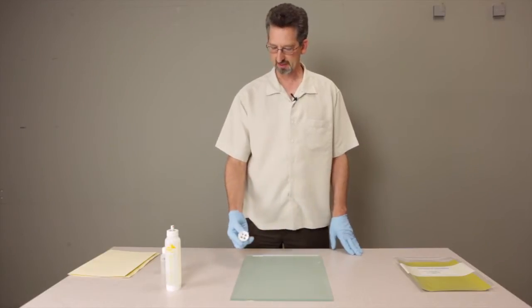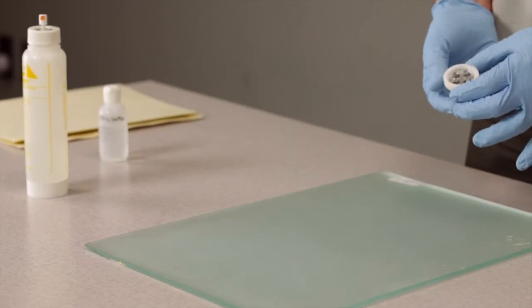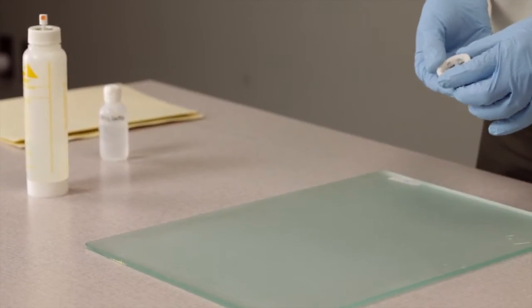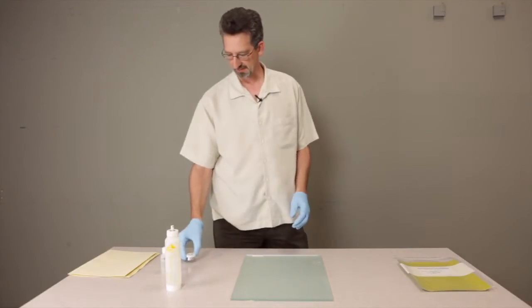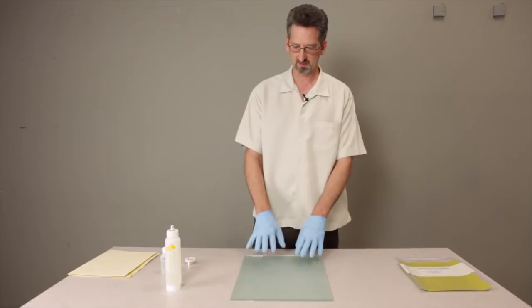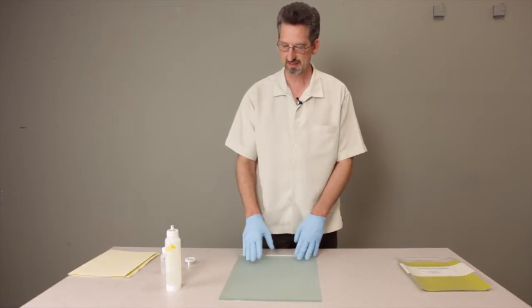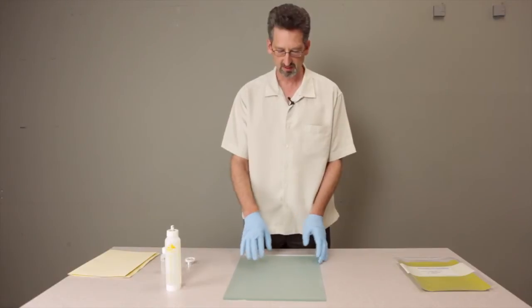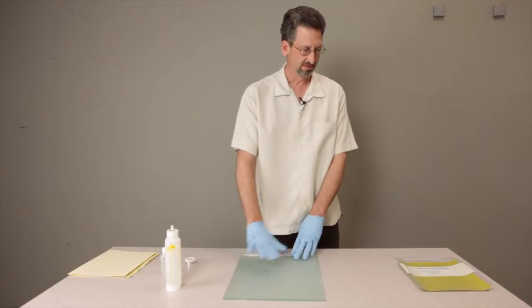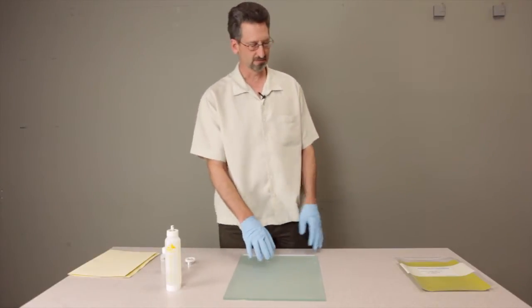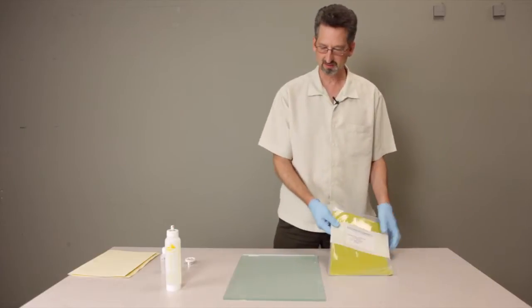All right, our next step in preparation is to polish the sample. We'll start with preparing this glass plate so that it will stay on to the table. We're going to use that as our very flat surface for our aluminum oxide abrasive.